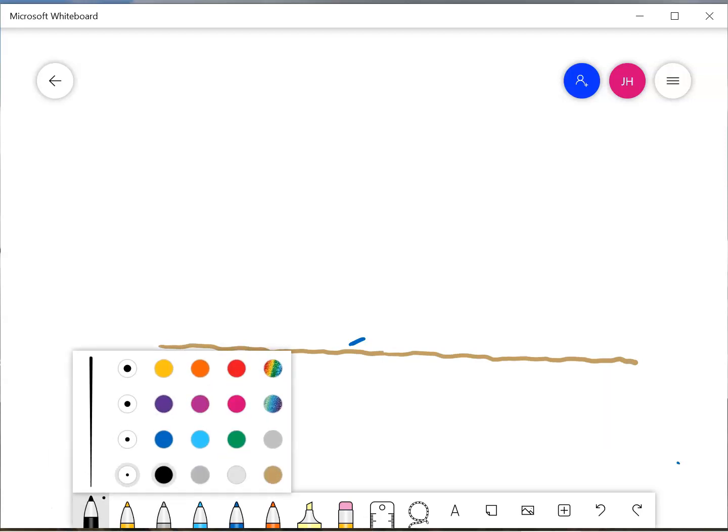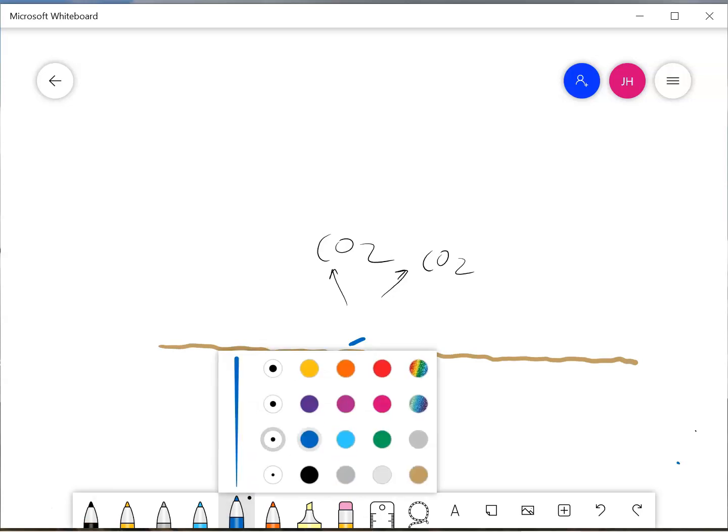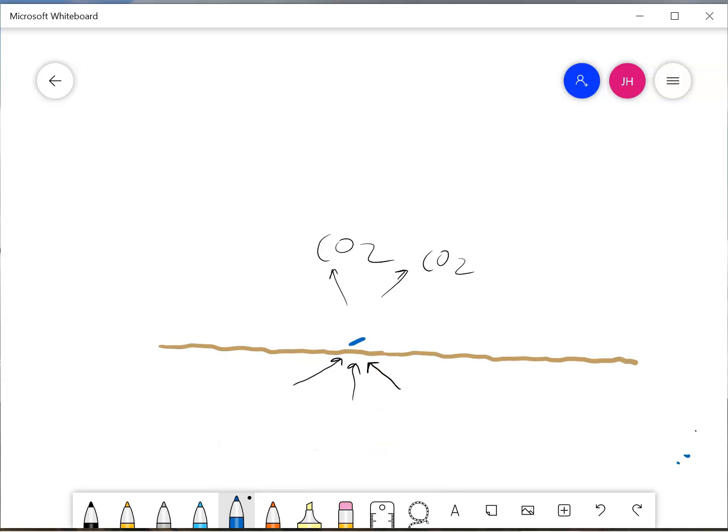So what's going to happen? Well, nutrients. This is going to start using whatever nutrients are dissolved in the agar. So remember, agar is mostly water, and agar solidifies the water, and then all the nutrients are dissolved in the water. So down here is where we would have carbon sources, energy sources, electron sources, nitrogen sources, phosphorus, sulfur, all that different stuff in different molecules dissolved in the water. And so as this cell uses some of those, it releases waste products, like gases, like carbon dioxide, and nutrients are going to move towards it through diffusion. So that's going to happen, and that's going to allow the cell to get more nutrients and divide.